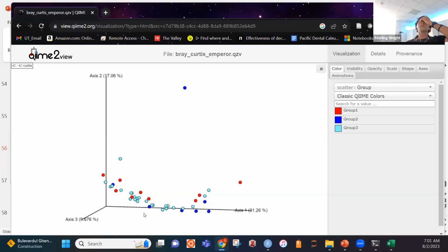When you're doing these multivariate analyses, you need some way to condense and compress that information because it becomes too overwhelming and too multidimensional. So really we're trying to extract the most important dimensions or variables in our data set, like what species account for the most variation. That's what we're doing here with the PCoA.